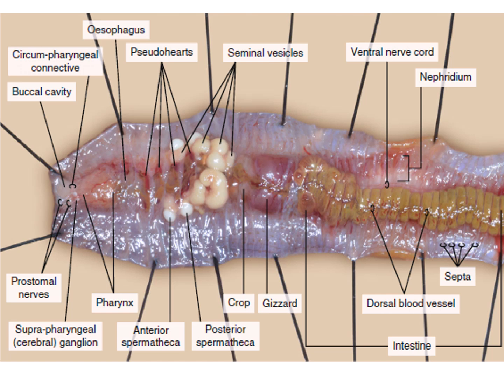Here we can see the buccal cavity, and after that is a structure that is the muscular pharynx. This muscular pharynx helps in sucking action. It is attached to muscles. These muscles were torn by dissection, and the pharynx could look hairy due to those broken muscles.